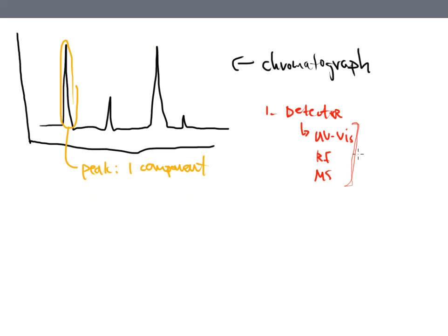Now, if you've not taken that class yet, but you're taking chromatography first, then keep that in mind. Next time that you take our instrumentation classes, you'll be taking spectroscopy. And the reason that we go into the detail that we go into is because these are the detectors that are commonly used on the chromatography instruments themselves.